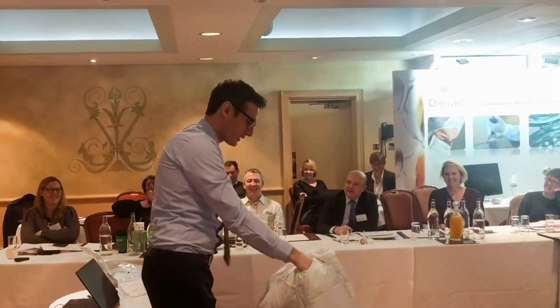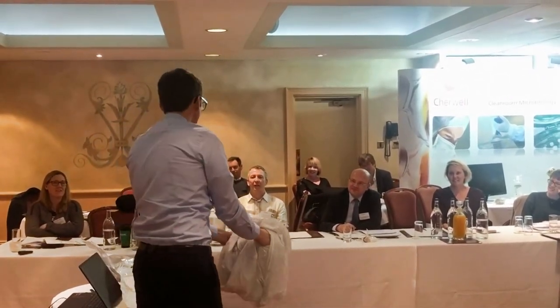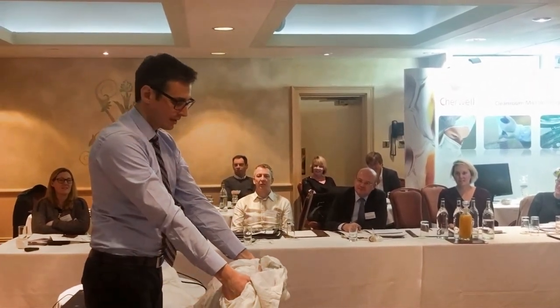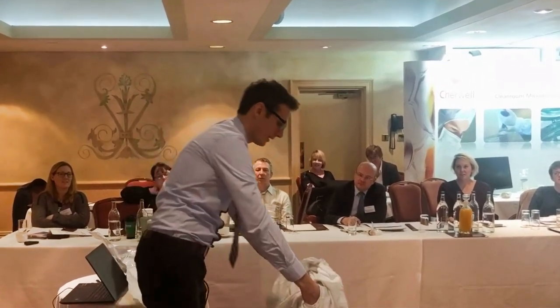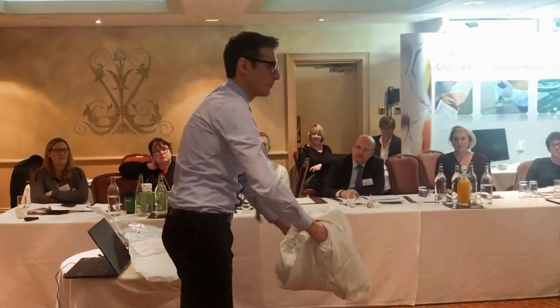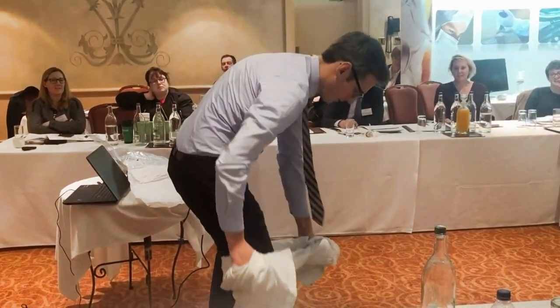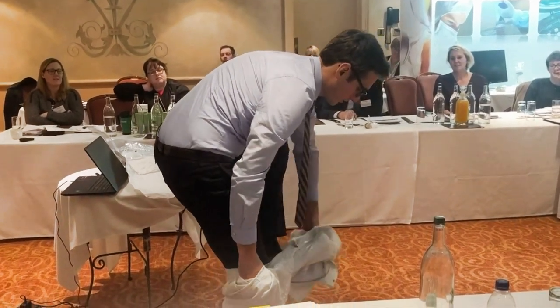So what's the advantage? It's quite compact. And I'm only touching it on the inside. Now, this is a critical step for the aseptic gowning, to protect my boots from contaminating it with my foot when I step into the overall. I did some yoga this morning to be flexible, and then step into the overall.